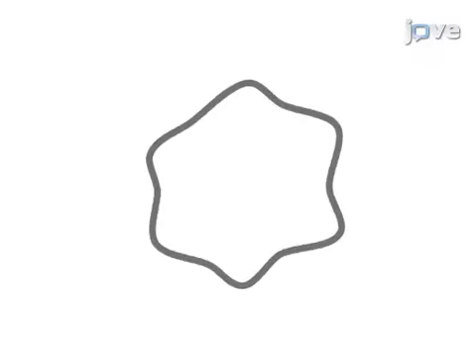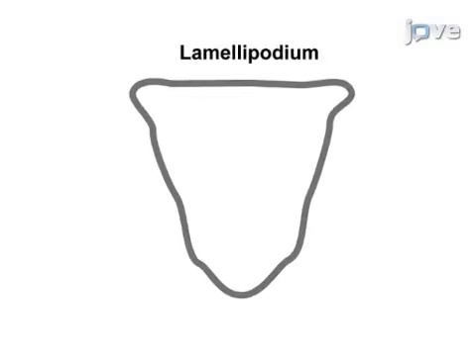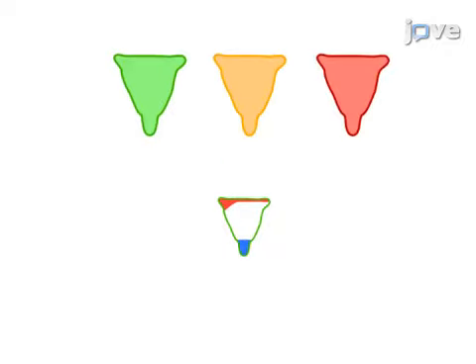This is accomplished by first stimulating the T cells with the chemokines of interest. In the second step, the cells are fluorescently labeled and then analyzed by imaging flow cytometry.